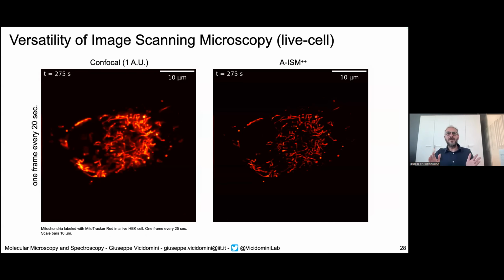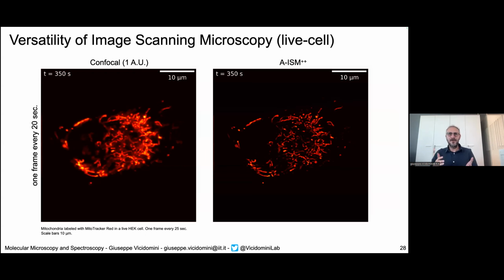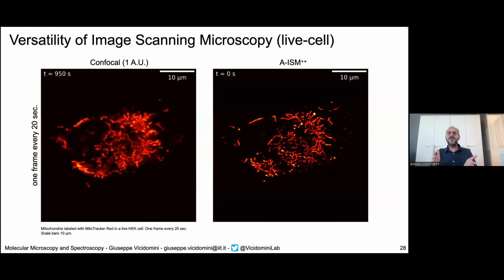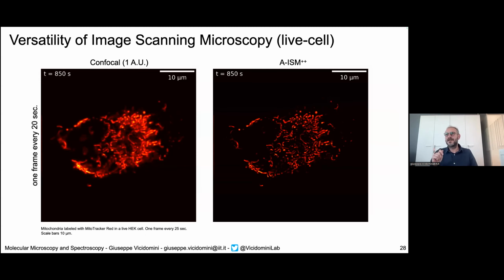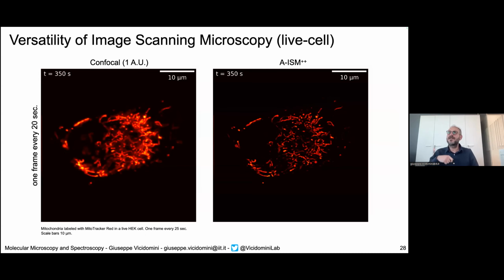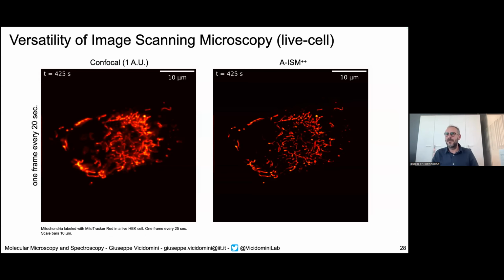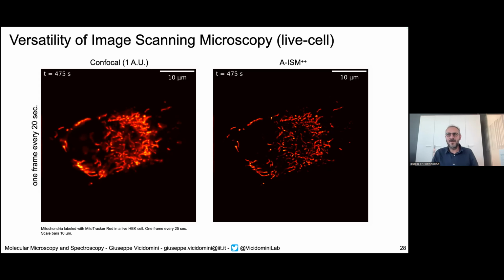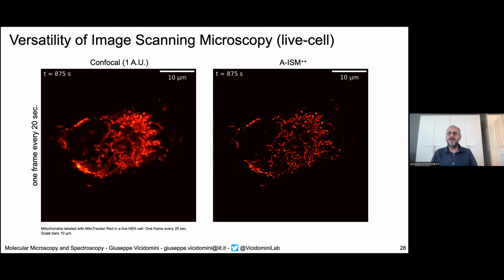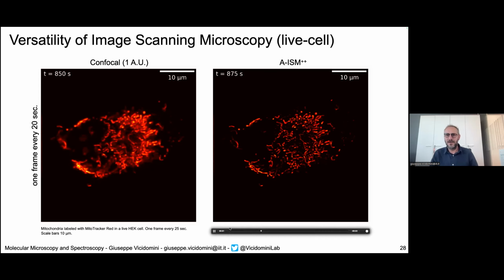So you improve the signal to noise ratio, which maybe you are not interested in, you are interested in super resolution. But if you improve the signal to noise ratio, it means that you can reduce the intensity of light that you project onto your sample. And that means that you can acquire your sample longer. So that's a technique that is super useful in terms of long-term imaging. So if super resolution is your aim, that's great. But if long-term imaging and super resolution is your aim, again, that's the perfect technique to use.